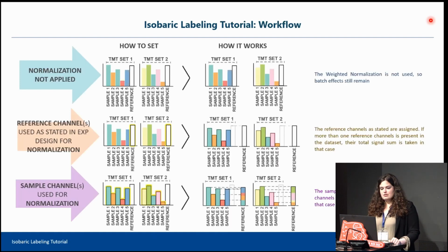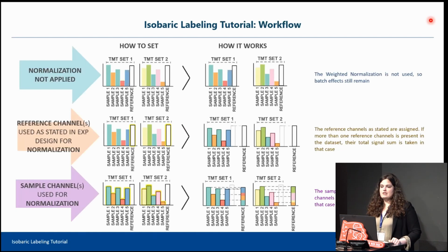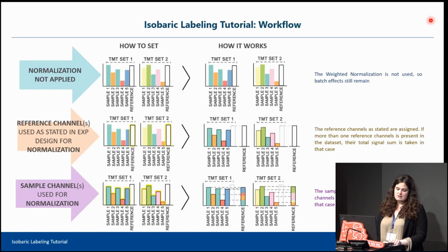What MaxQuant will do is that in the first option, as I said, it will not do any normalization because we didn't set up any normalization. In the second option, the orange one, it is exactly normalized based on the reference channel as it is.